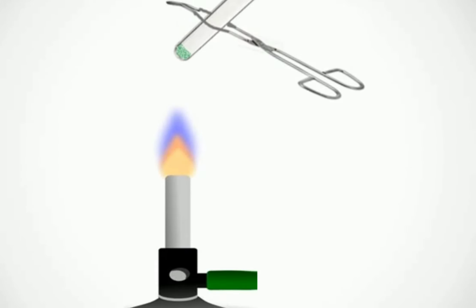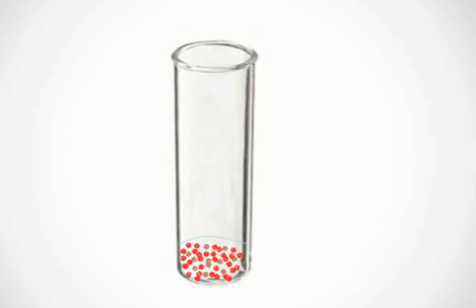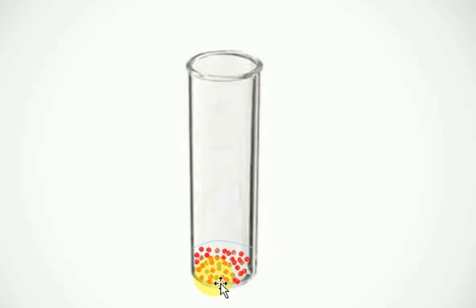Take a burner and heat the boiling tube. Burning sulphur gives an odorous smell. After heating ferrous sulphate, we obtain reddish brown ferric oxide.